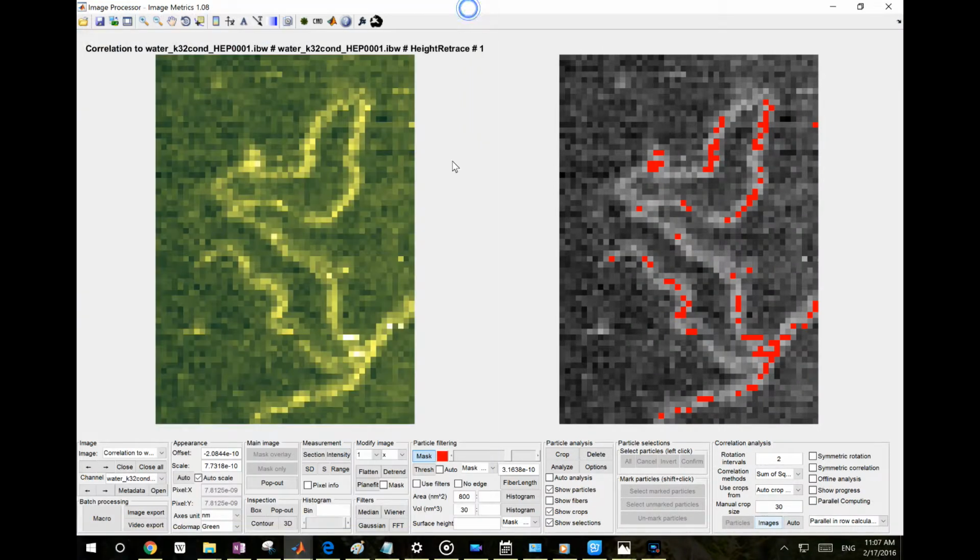So these are examples of correlation averaging used to enhance signal-to-noise ratio and to analyze dynamics. If the dynamics change, you see a decrease in signals; if they are stable, you get an enhanced signal-to-noise ratio. So these are pretty useful.